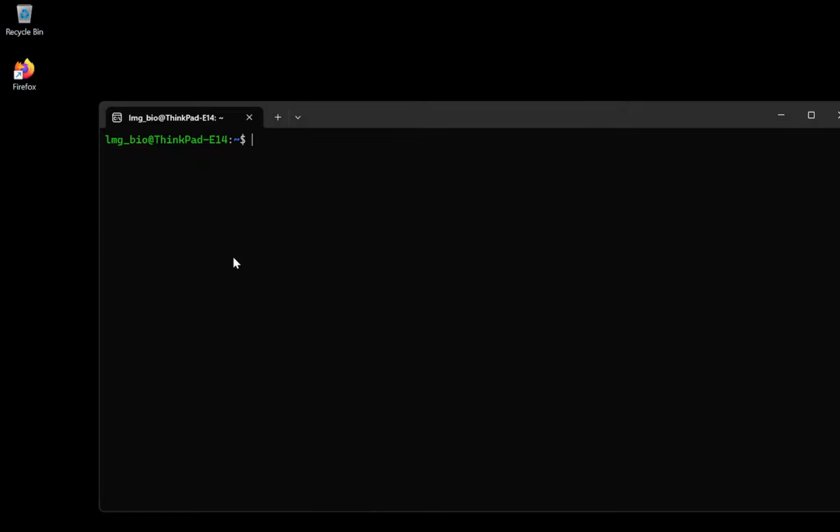But first we are going to create some directories. We are going to create, using mkdir, one directory called NGS course.